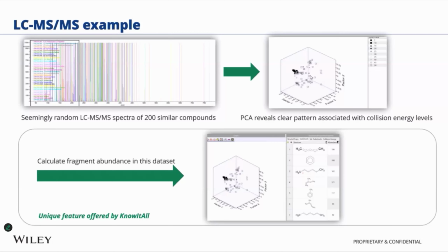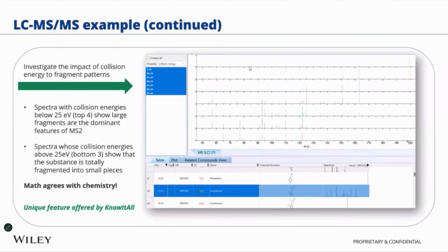Importantly, I'm interested in this little star here, okay? The little star corresponding to collision energy 25, but it is in a space pretty scattered out, close to higher collision energy MS spectrum. So I'm taking a look at that, okay? I'm clicking on that because we are in the KnowItAll environment. Easily you can go to the record itself.